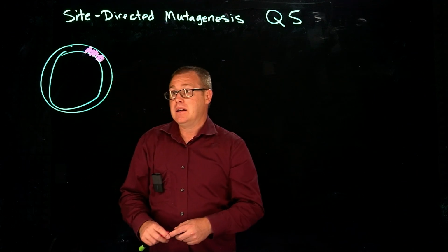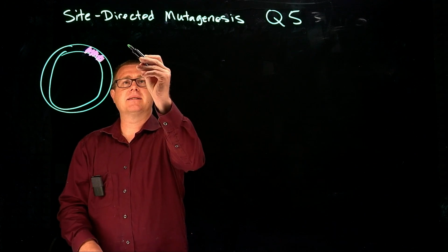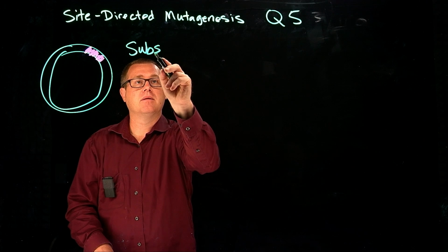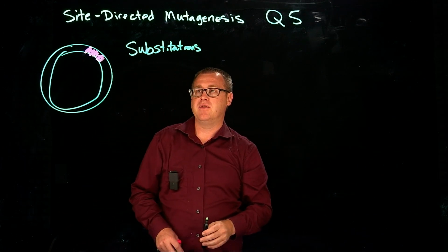Okay? And so let's take a look at substitution. So substitutions with the Q5.